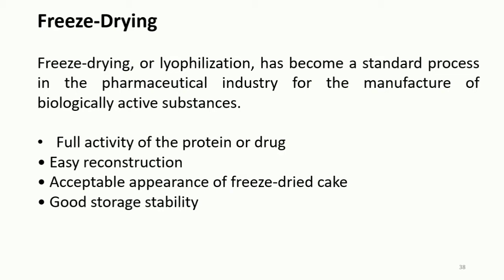However, it is not without limitations due to its high cost in capital and energy, and we can say even in long processing time. Moreover, there is difficulty in selecting manufacturing conditions of time, temperature, vacuum, and component concentration.